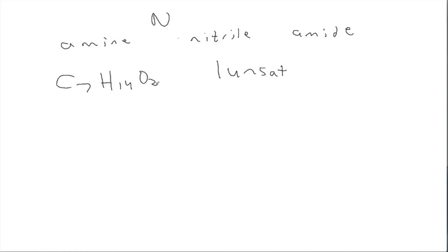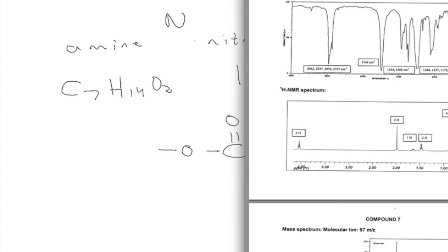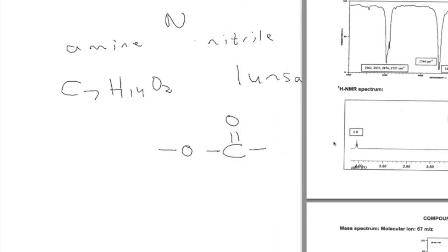One thing we've learned is that if you use that detailed table, we know it's an ester, because esters are around 1735 and our peak was around 1744. So we know we have an ester group. So I would start by writing the ester group.